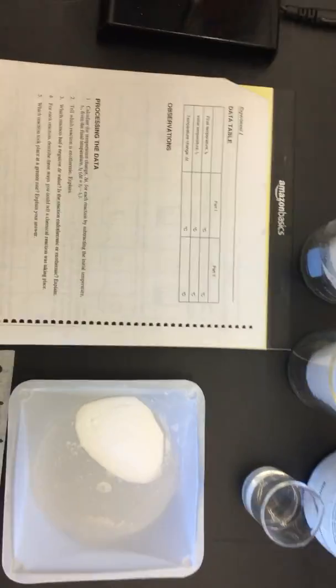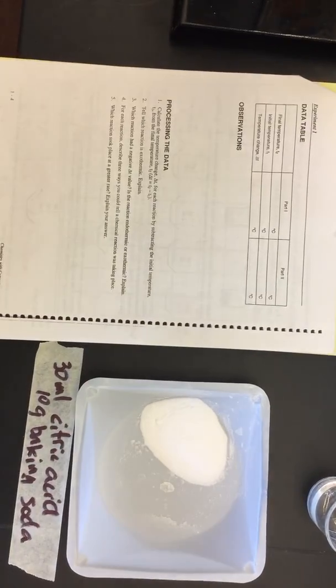One of these is endothermic and one of these is going to be exothermic, and we'll be able to tell by taking the final temperature minus the initial temperature. So that's what we're going to be doing. I'm just going to set this here for now.